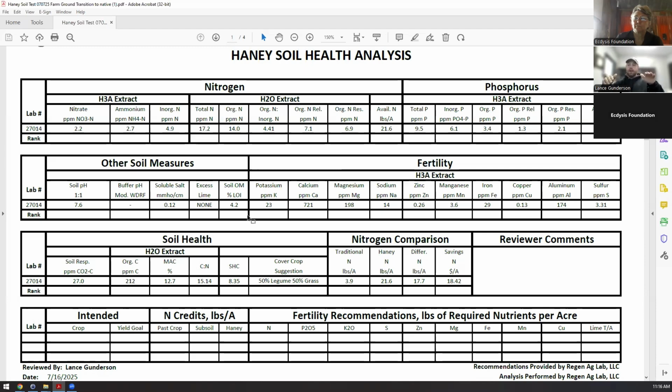I know you probably can't see my hands. The carbon goes down and then the respiration is up and we get that above 100%. If it's short term, meaning a couple of weeks and it only happens maybe a couple times throughout the year, that's okay. If we start to see it be more of a constant pattern, from a management standpoint, what that tells me is I need to figure out a way to increase carbon capture or carbon input into my system to offset the demand from the microbes.